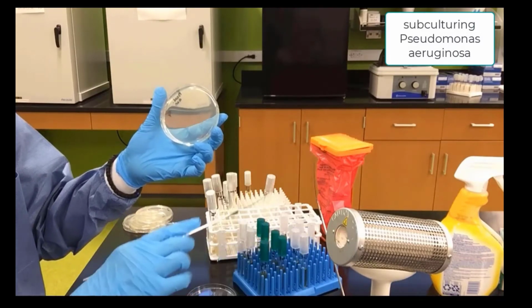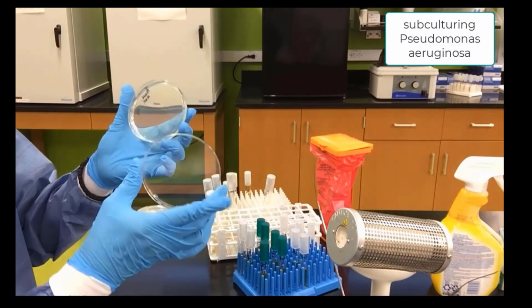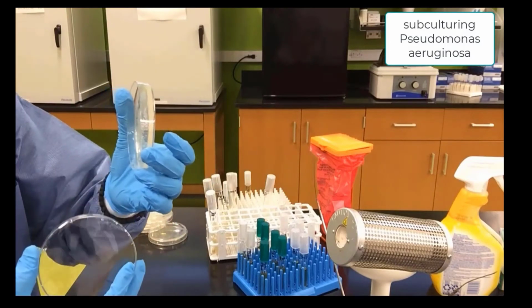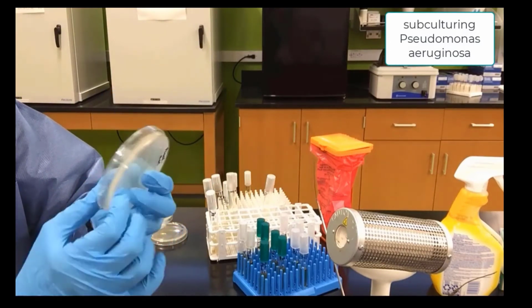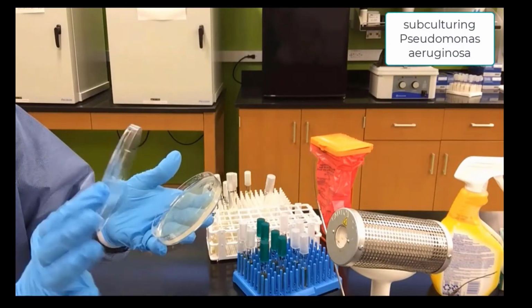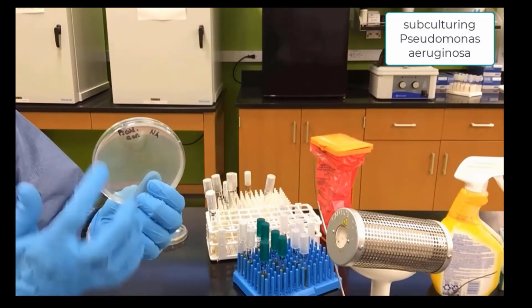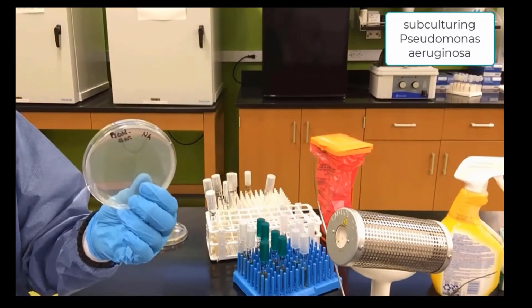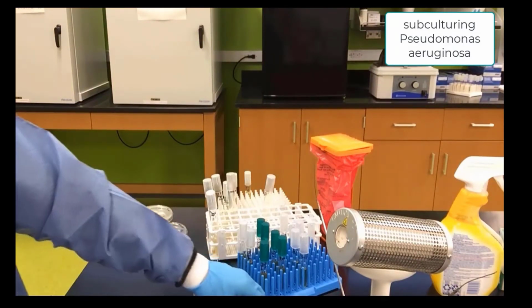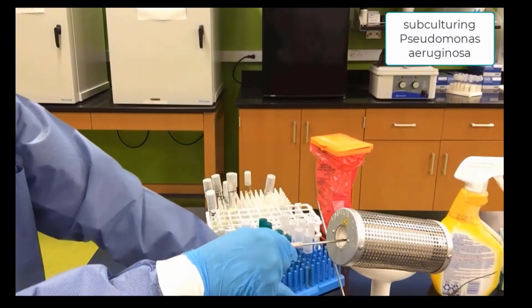Now, the agar plate here is out in the open because the instructor has to show you how the streaking of the plate is. But you want to make sure you know where the lid is. The bottom part is the part that has the actual agar. And then we label the back, the bottom as we say, not the lid because the lid can fall off or it can be misplaced. So really when we inoculate these, we place them on the table and barely lift the lid to make the streaks. But again, in this video, we had to have it nice and open so you can view the streaking method of the plate. Now we will use the needle.